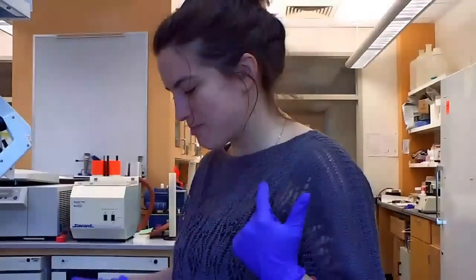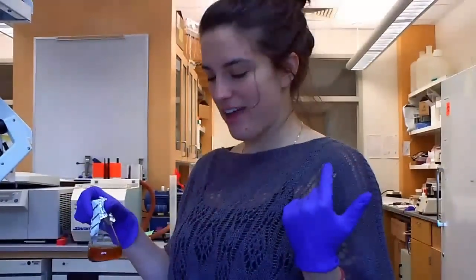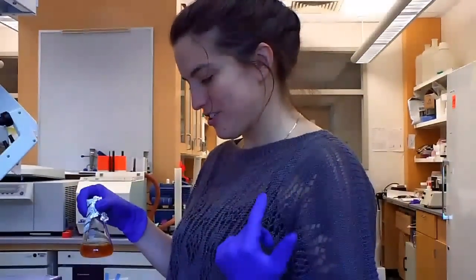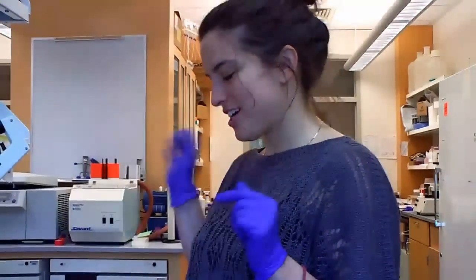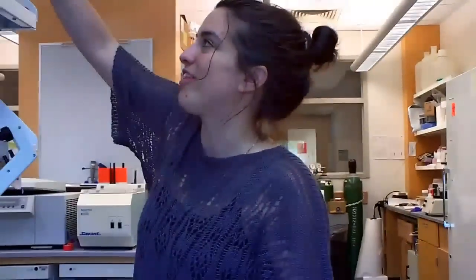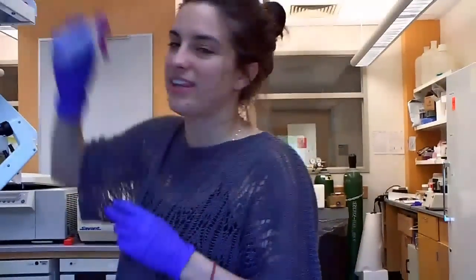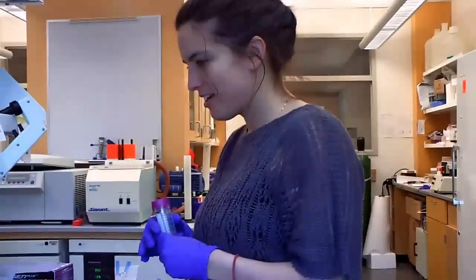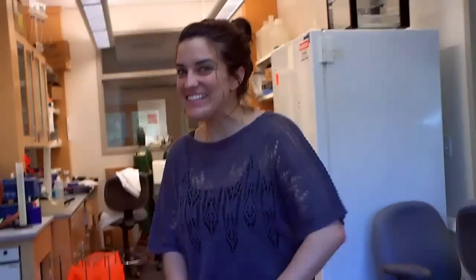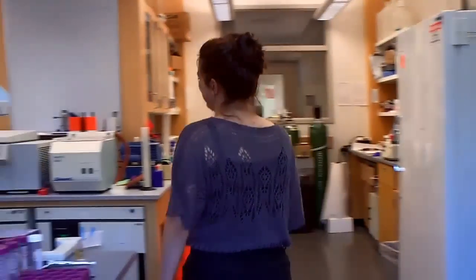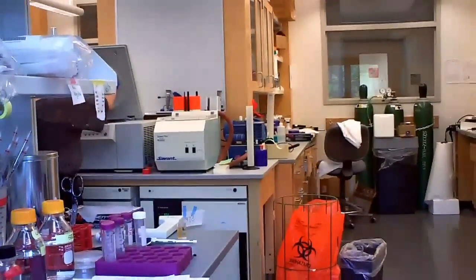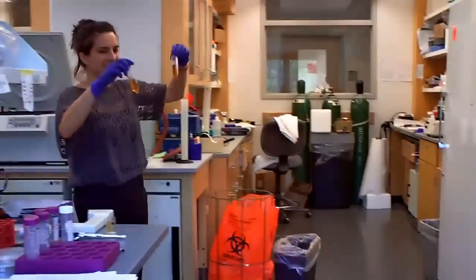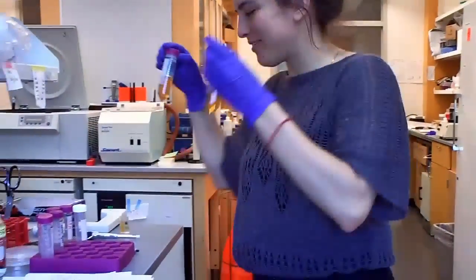So now I need to spin the cells down at 3000 G for 5 minutes and then wash with 25 ml of water and then resuspend with 1 ml of water. So for that, I'll separate the two into two different conical tubes. Five minutes is done!